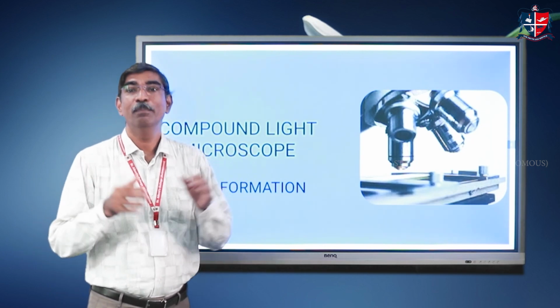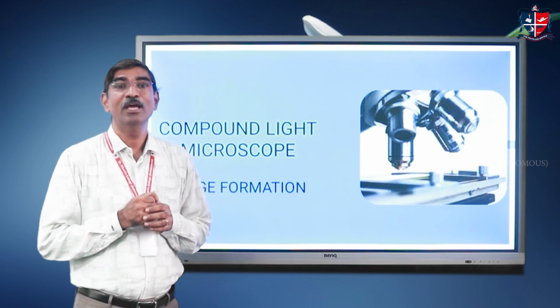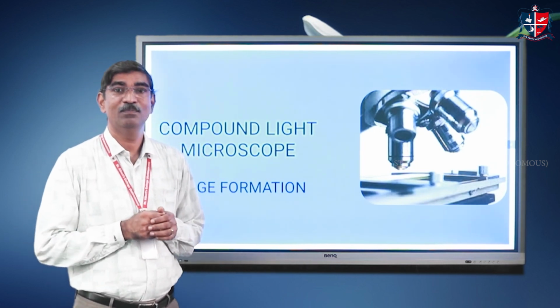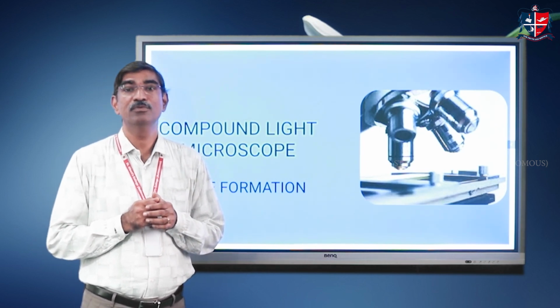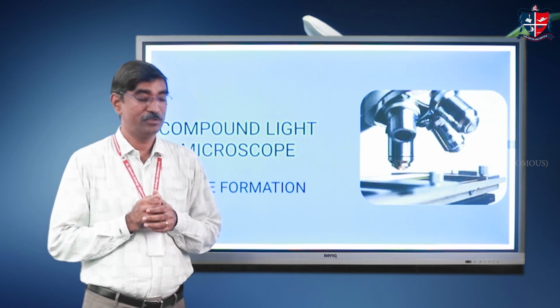The first picture that comes to your mind when you think about a biology lab is a microscope. So, such an inevitable role these microscopes have in biological labs.